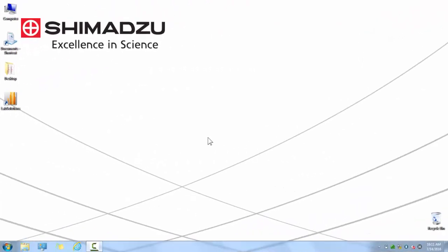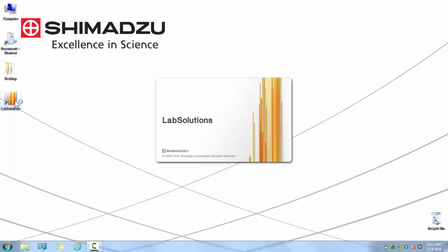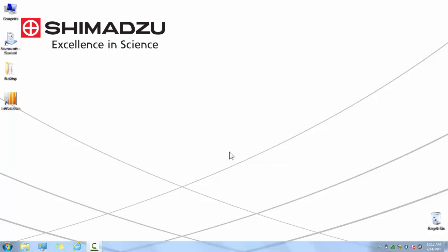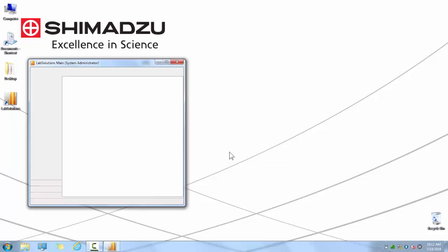Once LabSolutions software is installed and your license dongle is inserted, you will launch LabSolutions by double-clicking on the icon on your desktop. The initial user ID is admin with a capital A and there is no initial password. Click OK to log in.